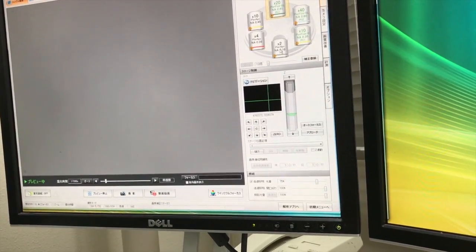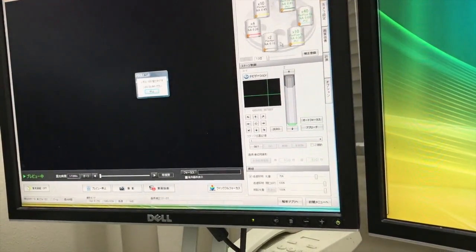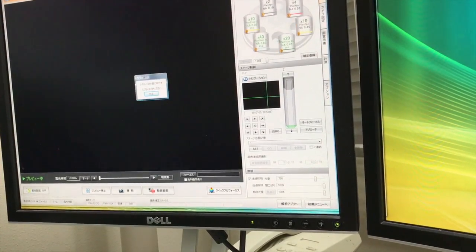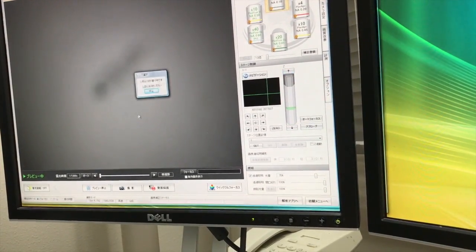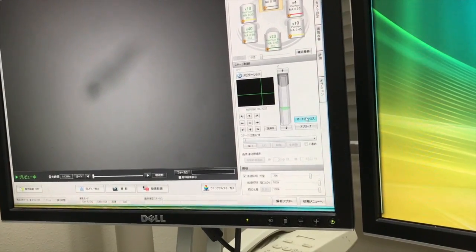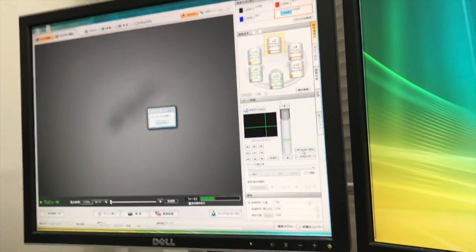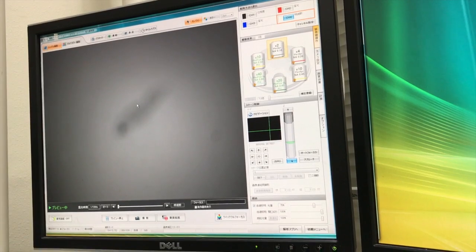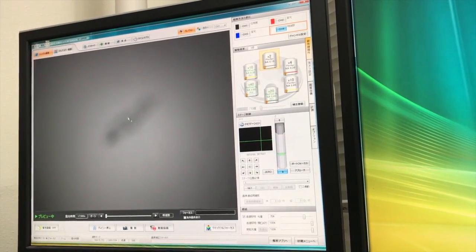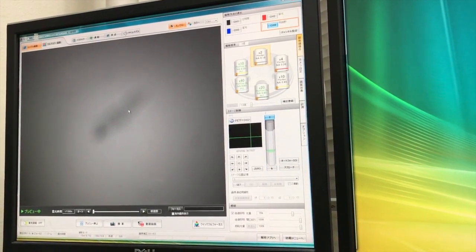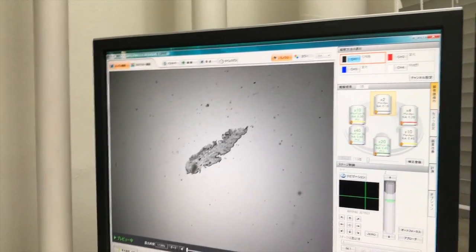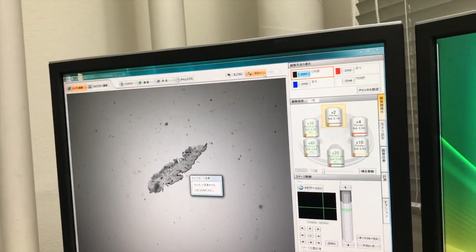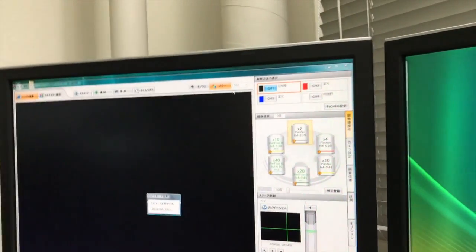Because we can switch. Let's switch. Yes. Oh, maybe let's do autofocus. Adjust the focus first. Maybe the... Not this 42. Just the 4. The color is this one. Okay. I can switch it.